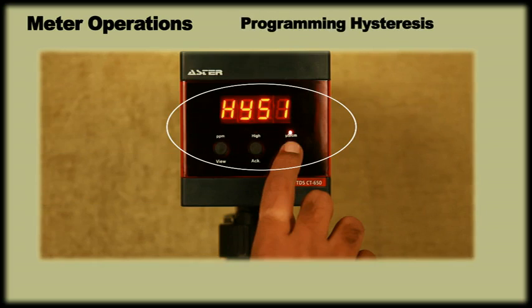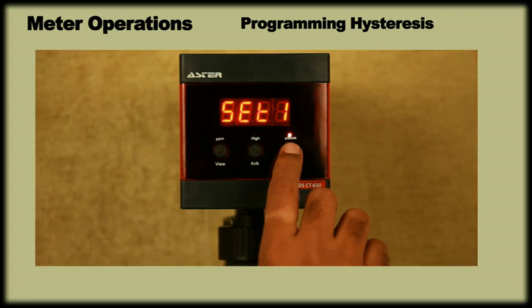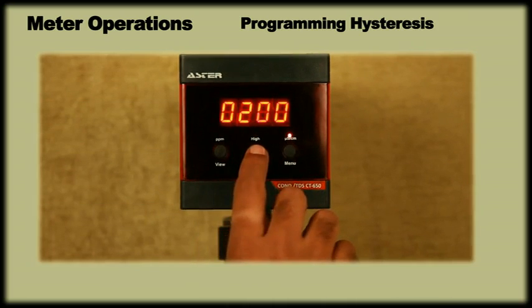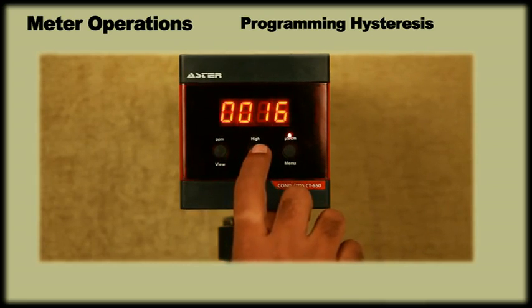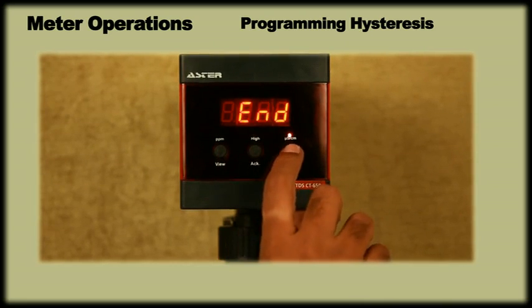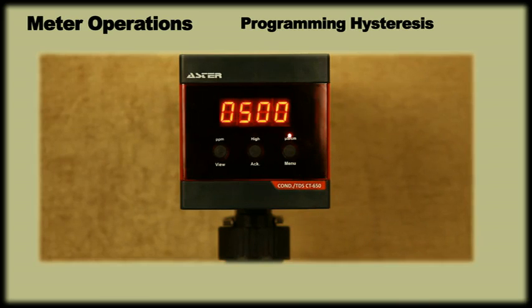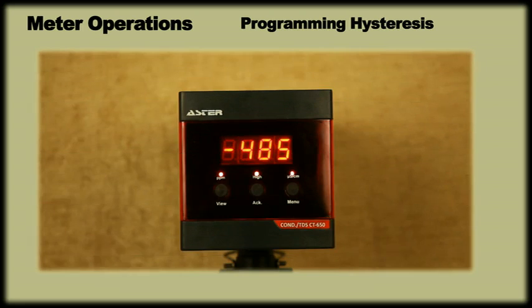After setting the set point, the display will show hysteresis. Hysteresis is basically the percentage value of the set point for which the relay will not reset after getting energized. For instance, if our set point is at 500 and the hysteresis value is set at 10%, then the relay will get energized the moment conductivity exceeds 500 and remain energized until the value goes down to 450, which is 10% less of the set point value.